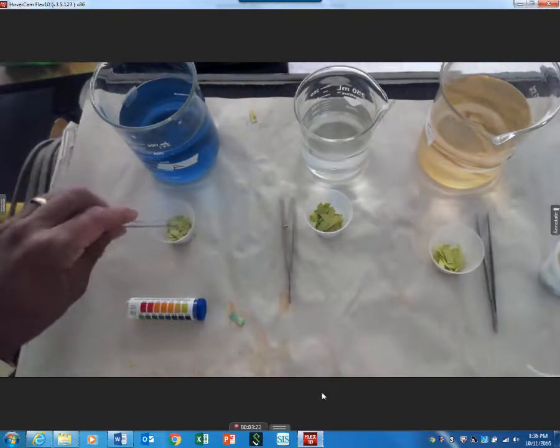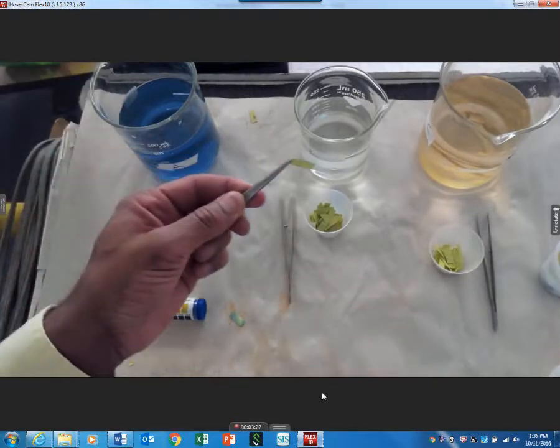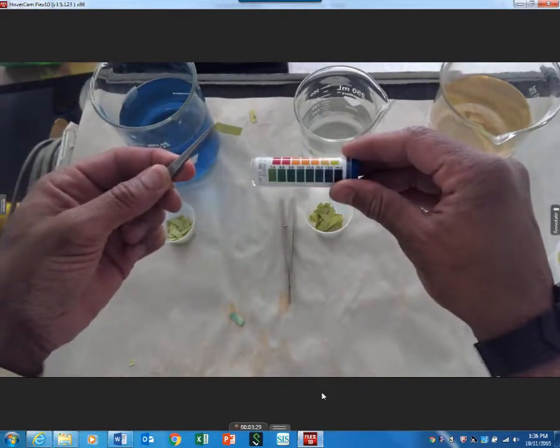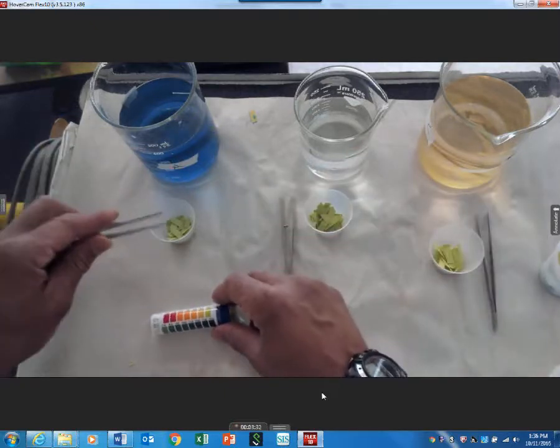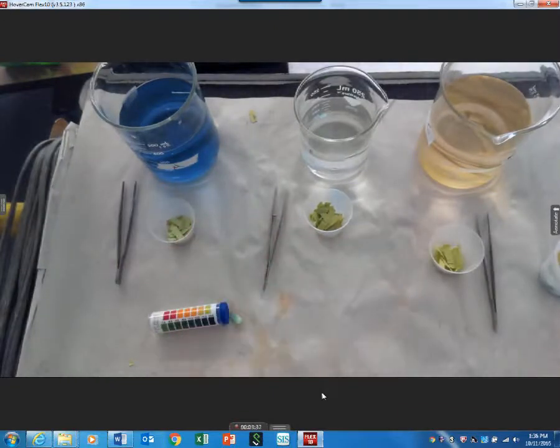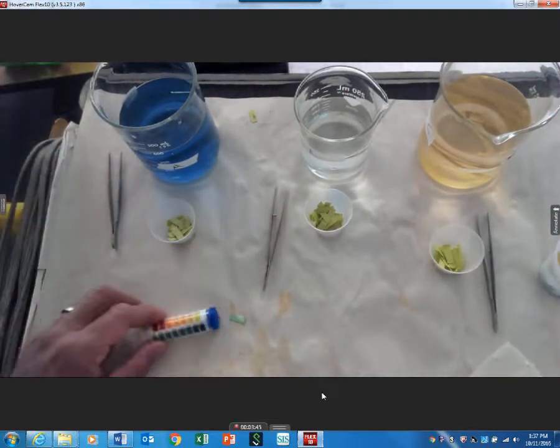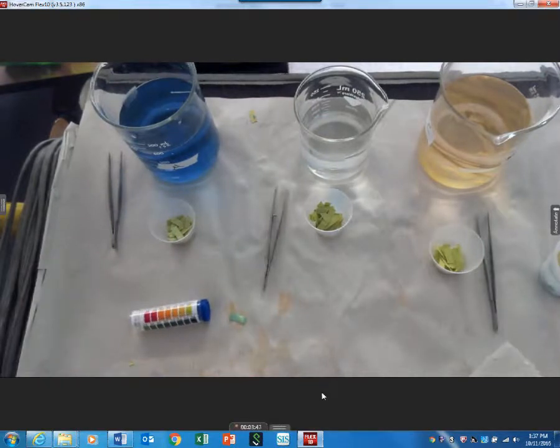Let's make sure before you start you thoroughly wipe this down. You take one in, and I'm not going to drop it in there, but you dip it, pull it out, and on the table you have a little scale. You're going to write down the pH. That's it. Wipe it down, drop it, move on to the next one. Where this gets kind of busy is if there's 3 or 4 people up there. So you have A, make sure you put it back with A. And we only have 1 scale for you to look at. So there's 3 different substances. Identify the pH.